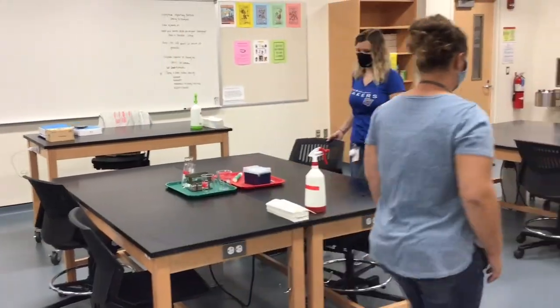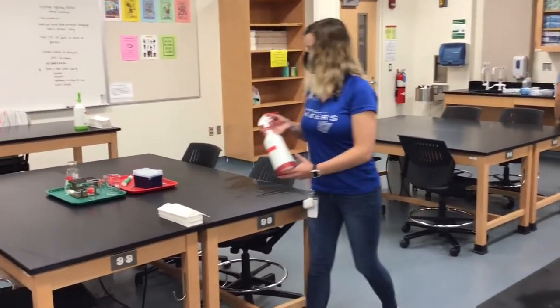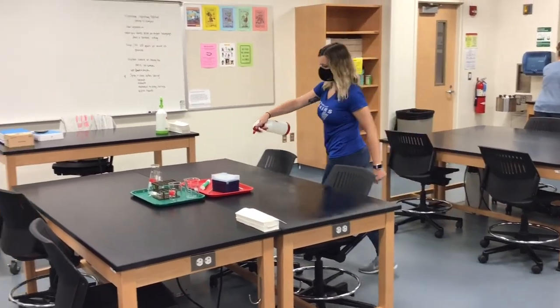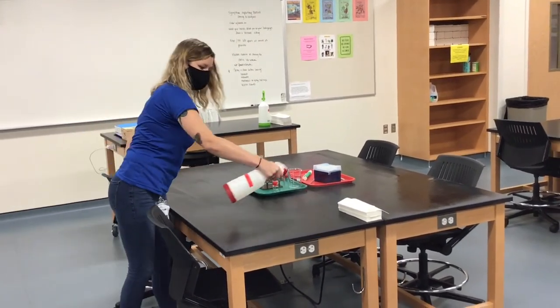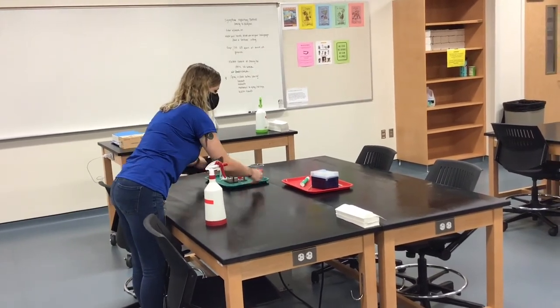When lab is finished, you'll want to wash your hands before leaving. Before doing so, either you or your partner needs to spray down the table with ethanol. Do not wipe down the table after you've sprayed it — leaving the ethanol spray on the table will kill any germs left behind. This is why your table may still be wet when you enter the lab following another section.